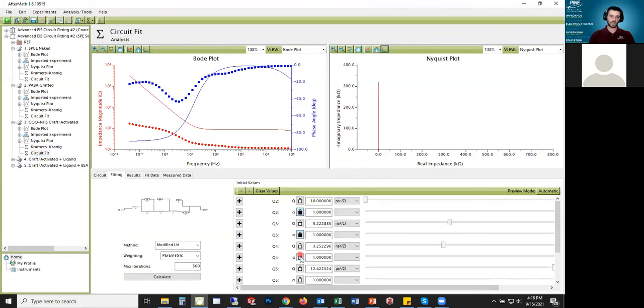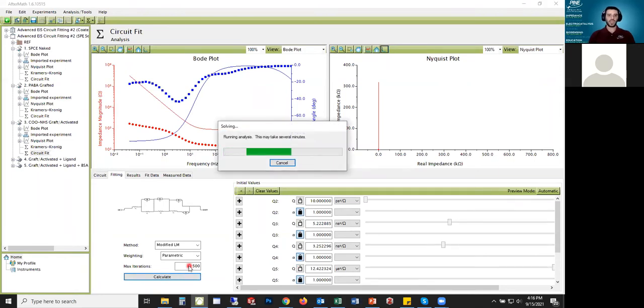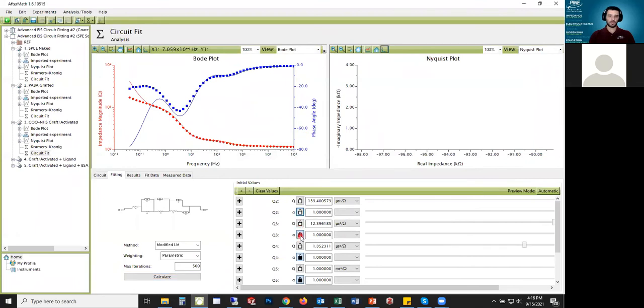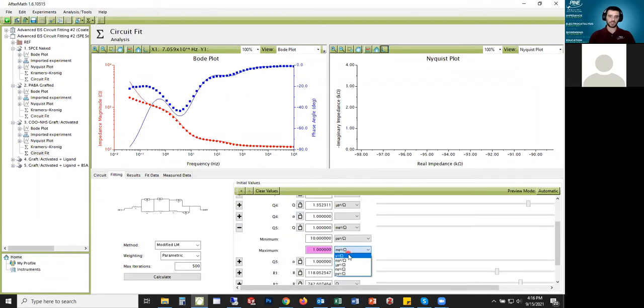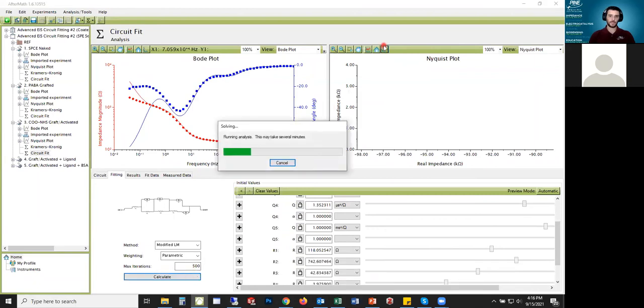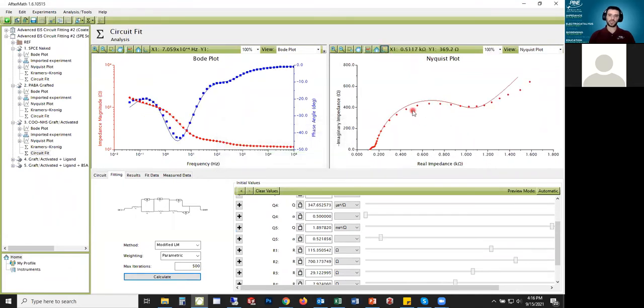The same kind of circuit fit can be done here where I lock all of the alpha values at one and do my calculation. And then unlock them and probably need to increase the range for one of these. Yep, this one is hitting its maximum limit so I'm going to increase that range and see if this fit will lock into place. And you can see that it looks pretty good. I could probably iterate a little again on this part. It's kind of not quite fitting. Also this angle seems like it's a little bit too high. This needs to come down a little bit. I could probably decrease that 0.5, that alpha there. But anyway for now this is adequate and I'm going to get to the interesting data if you will.